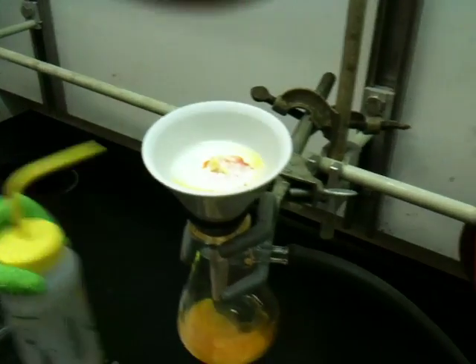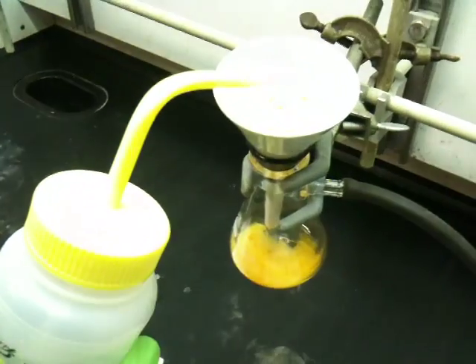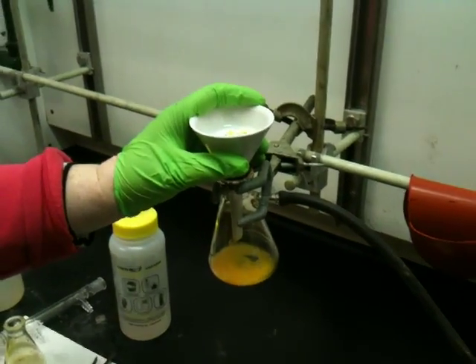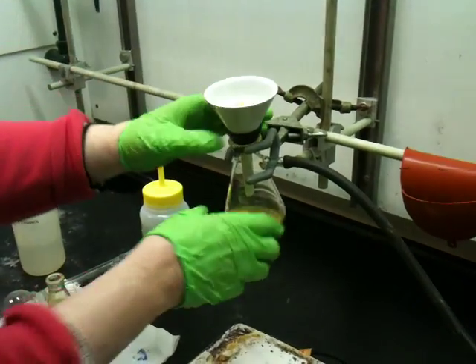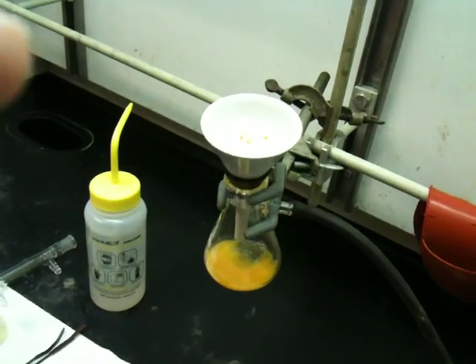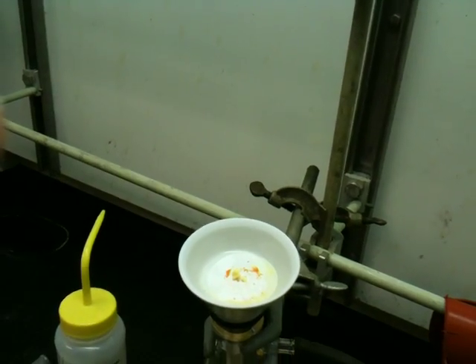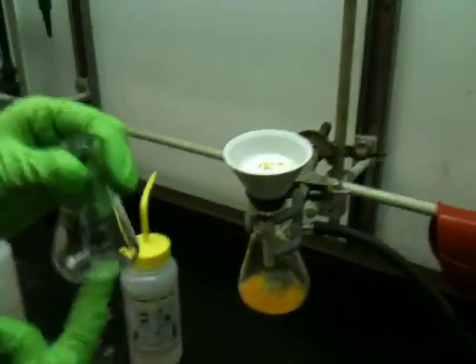Then we usually rinse it with a little bit of dichloromethane — this is a squeeze bottle of dichloromethane. Dichloromethane will dissolve the bromine. Usually at this point the solid is very sticky and goopy, and it's really hard to get off the filter paper. We have to recrystallize the solid, and it's really hard to transfer it from the filter paper into an Erlenmeyer to do a recrystallization.